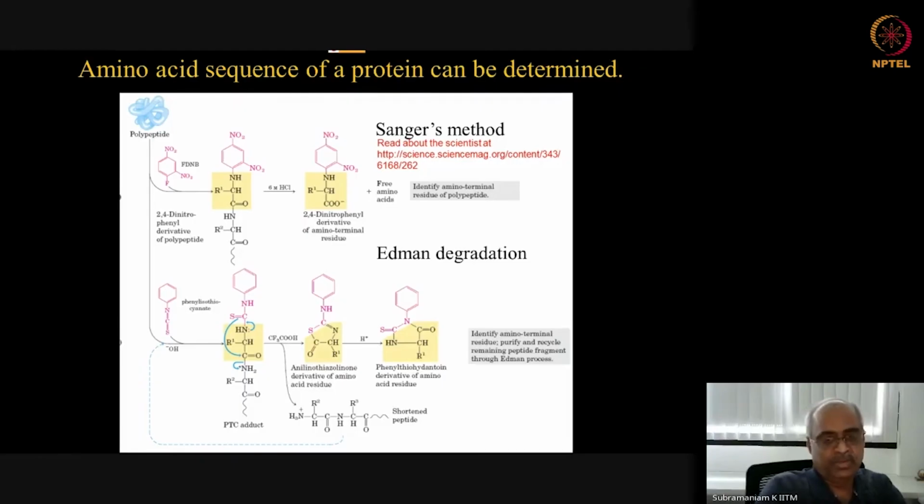Most of the time now we directly translate from the coding sequence of the nucleic acid, because nucleic acids are a lot easier to sequence. And based on that, we determine the amino acid sequence purely by theoretical translation of the triplet codon. But if a particular experiment demands that the actual protein is sequenced, the currently used automated method uses this chemistry called Edman degradation.